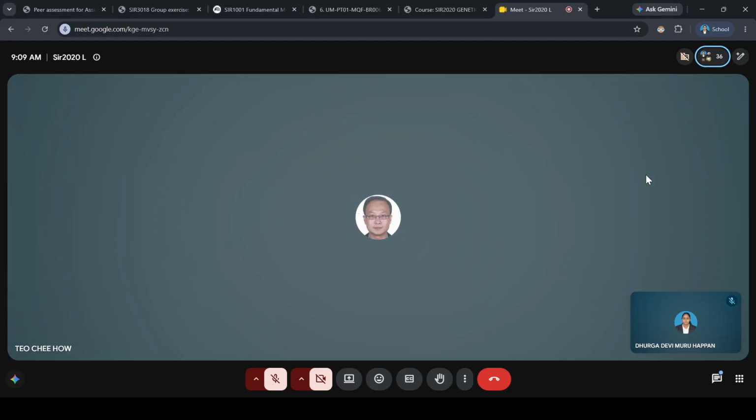How about others? Sometimes when you have an error in one of the runs, in this case it was because the previous step was wrong, and then subsequently you can't analyze.